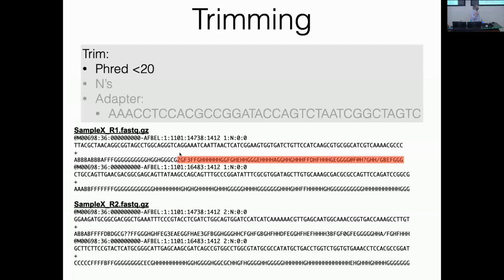Depending on what sort of analysis you're doing, that could range from mildly innocuous to kind of disastrous. So generally, when you trim, you'll take that position and trim everything 3' of it.